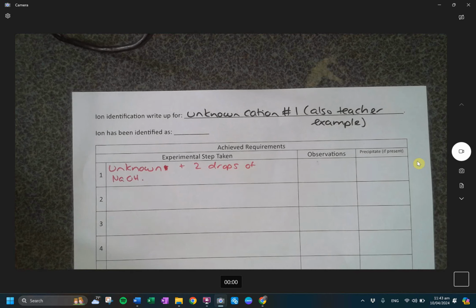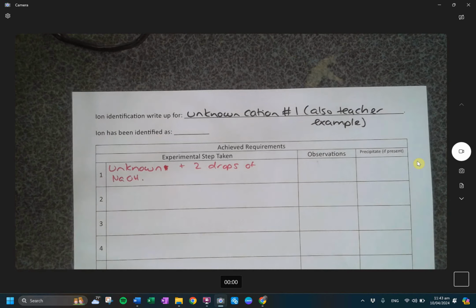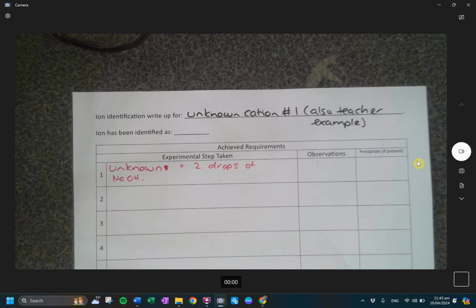All right, I'm looking for my sodium hydroxide, which hopefully is still in this box because you guys hopefully put everything back in the right spot. There are 2 sulfuric acids in there and no sodium hydroxide. Someone really mucked up my box here. There are 2 sulfuric acids in here and no sodium hydroxide. This one has no sodium hydroxide either. What are you guys doing? There we go. Might need to restock our boxes.